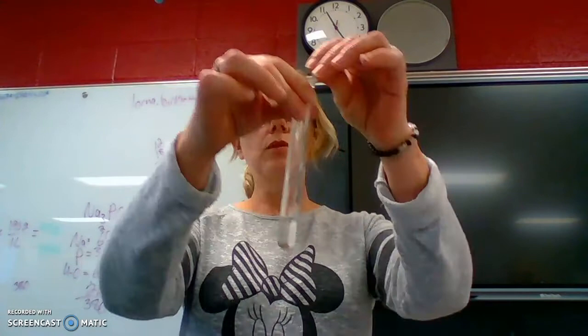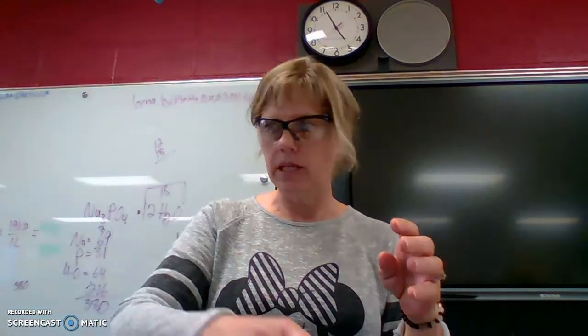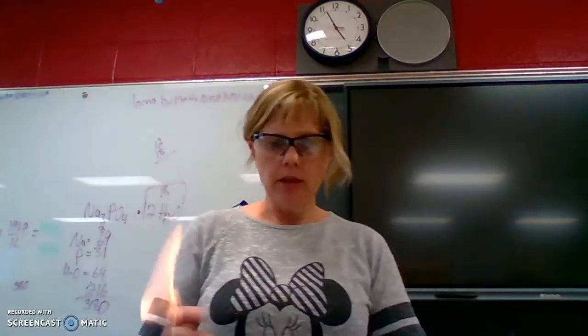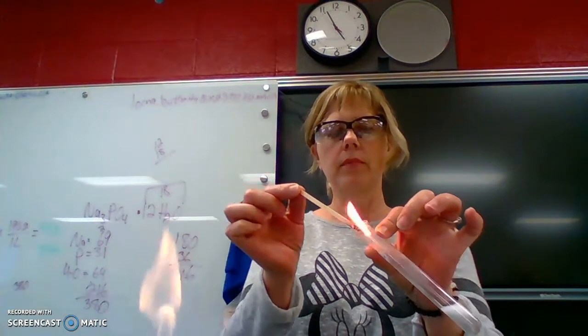So we already did reaction number 2. I'm just going to do it again. So this is my hydrochloric acid, and I dropped my magnesium in, and we said, oh yeah, it gets super fizzy, and it produces heat. Well, and I got a lot going on here. And then it's the last part it said to do, and I don't think I did it. I'm pretty sure I didn't, so I want to do it now.